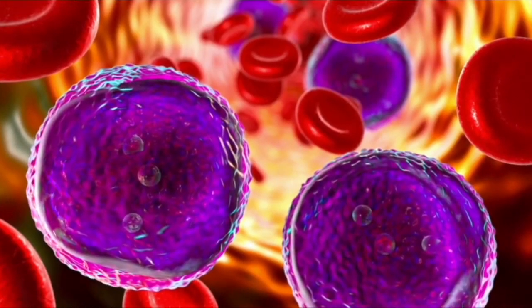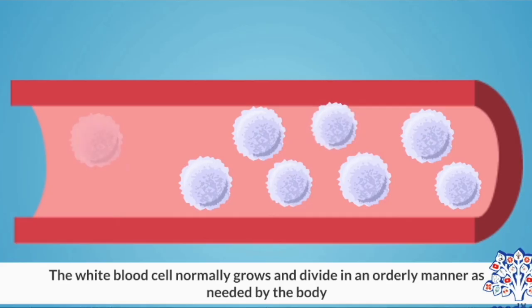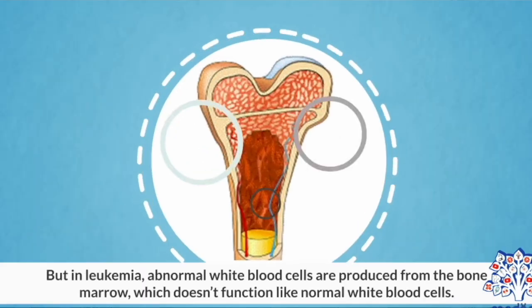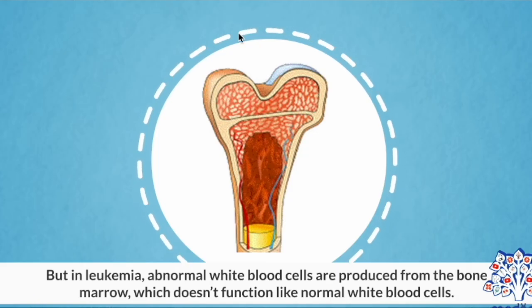How can we do immunophenotyping of blood and bone marrow samples to identify abnormal cell populations? We can differentiate between different types of leukemia, like whether it is acute or chronic, and lymphoma as well. So there are some common markers that can be identified, and then these diseases can be diagnosed.